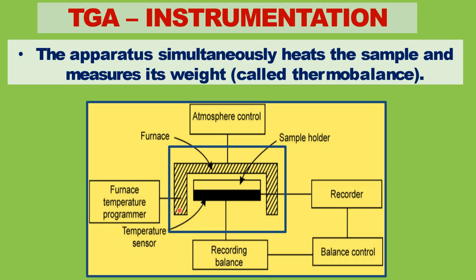The temperature is linearly increased by using the furnace temperature programmer. We have a temperature sensor to measure the temperature. We have a balance to measure the change in mass of the sample upon heating.